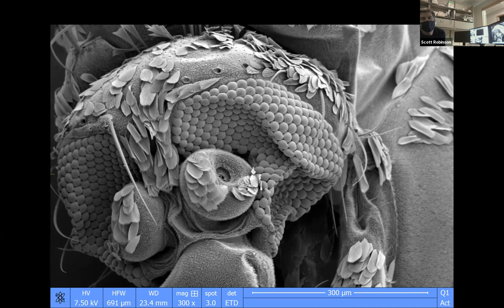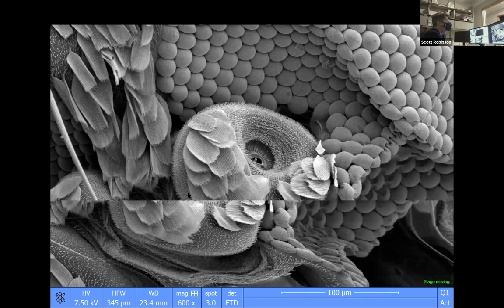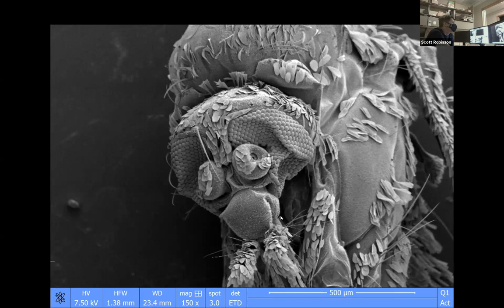When a mosquito comes to bite you, it's probably sensing the CO2 that comes from your breath. So it has receptors for that as well. Some of the receptors may be on the antenna. You can see that the antenna are broken off on this mosquito. And I think that this is a male mosquito.